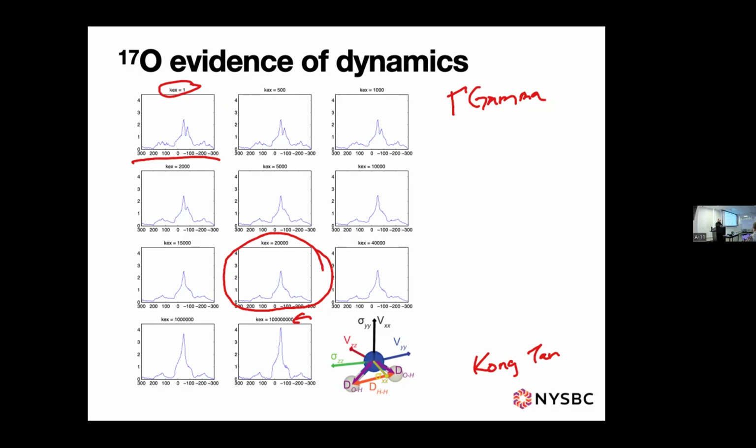And again, those two models in the slow exchange limit, are they because of ineffective decoupling, or are they because of two different isotropic shifts? There's no decoupling in this. There's not two different isotropic shifts. This is an effect because of the strong proton-proton dipole coupling. It's a splitting that happens because of that.